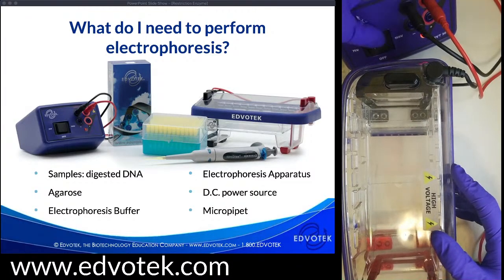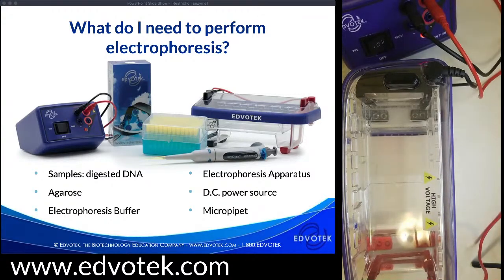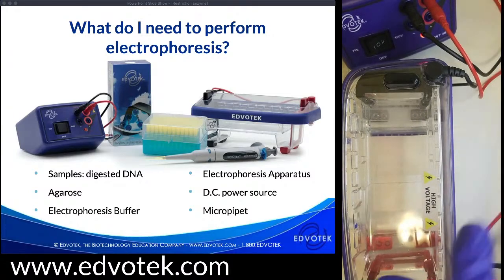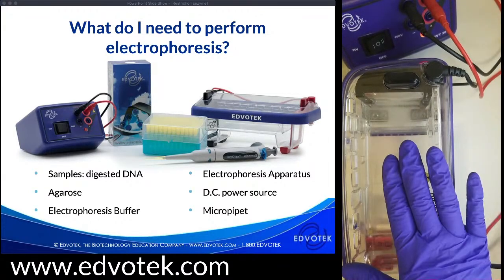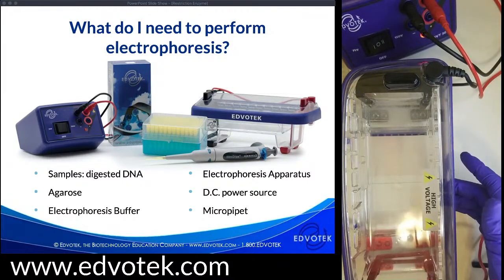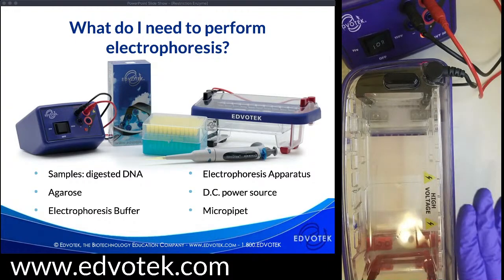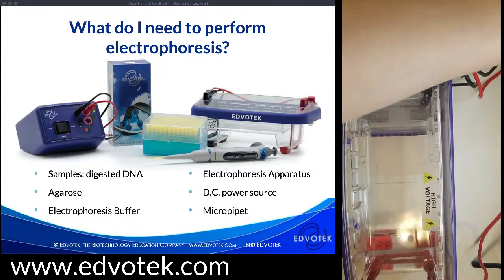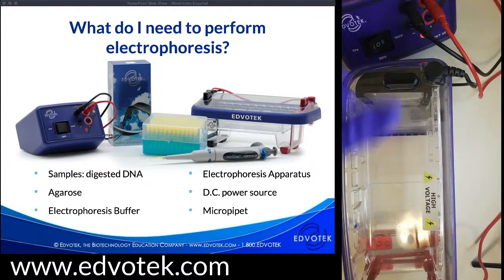I am going to hit go and let the electrophoresis begin. One thing I always like to do is check that I can see my bubbles at both terminals, then look at the gel and make sure that the dye is also traveling in the correct direction — from black to red — just to make sure I've got everything hooked up correctly. As many fail safes as we put into our equipment, one place we can make a mistake is at the leads. You want to make sure you plug the black into the black and red into the red so that your charge is going in the correct direction.